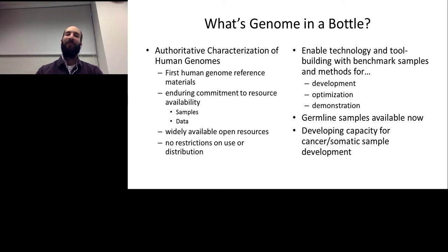That means that there have been a number of commercial products that actually use these samples as a basis for their reference samples that are aimed at more clinical uses. And there are no restrictions on publication on these data, and so we really encourage anyone to use these data as part of their methods development process, because that then helps us also in characterizing these genomes.